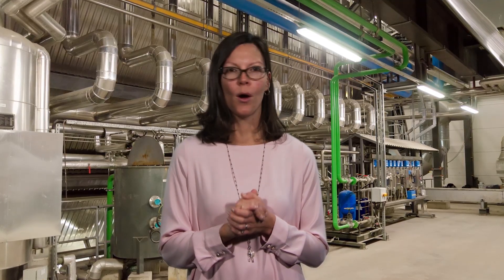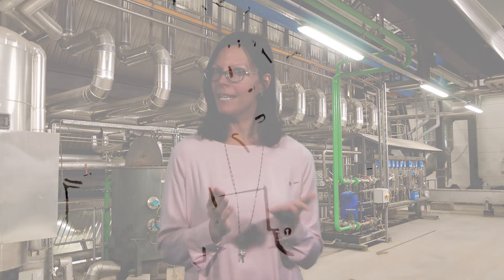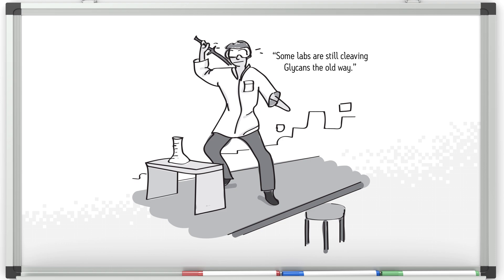In this episode of Behind the Science, we have a lingering question: what is the catch? We learned about a simple, fast way to prepare released N-glycan samples, but you must be giving something up for this time savings. Can something easy provide you quality results? There is no way you can have it all. Let me take you Behind the Science to help us answer the question of what do we lose for a workflow that is so fast and simple? And I know just the scientists to ask.